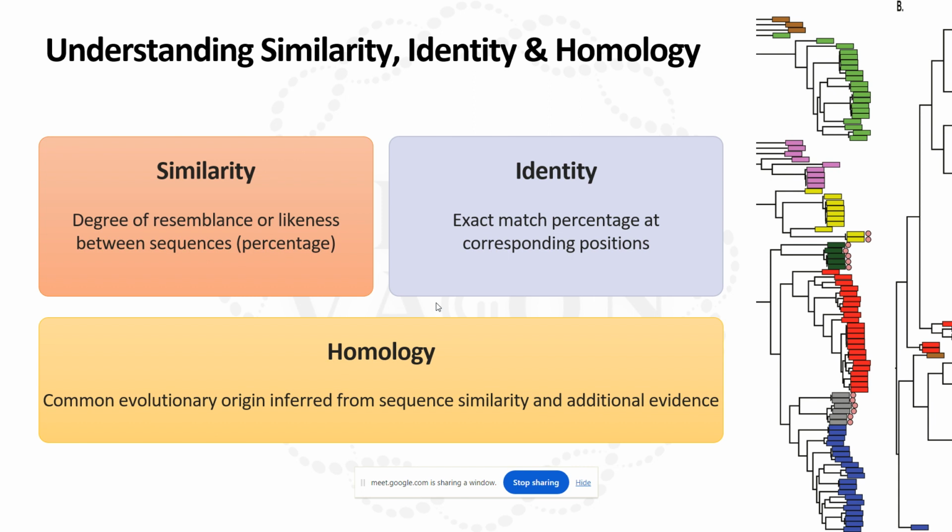Amino acid alignments may differ, and here they use a term called conservative substitutions. Amino acids are divided into various groups. They have a different structure, but they are biochemically the same and their function is the same. Those are called conservative substitutions.